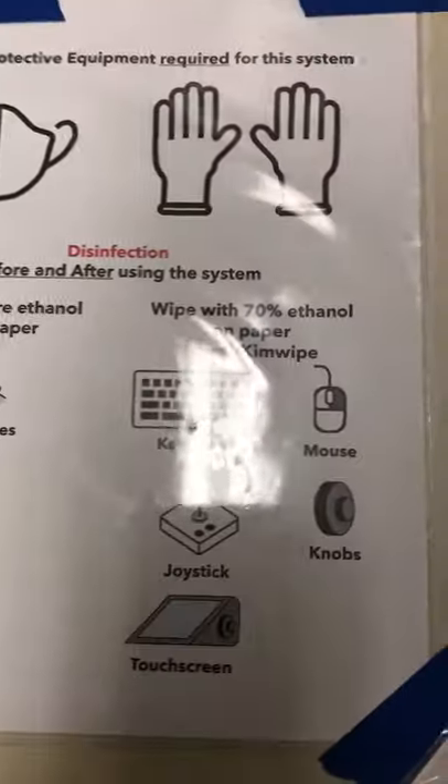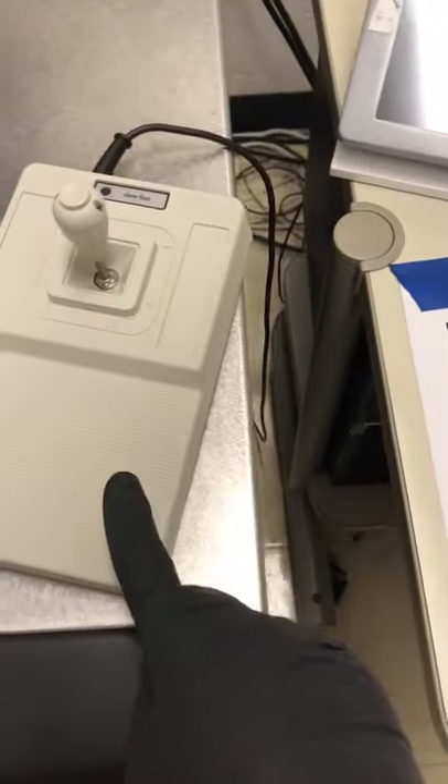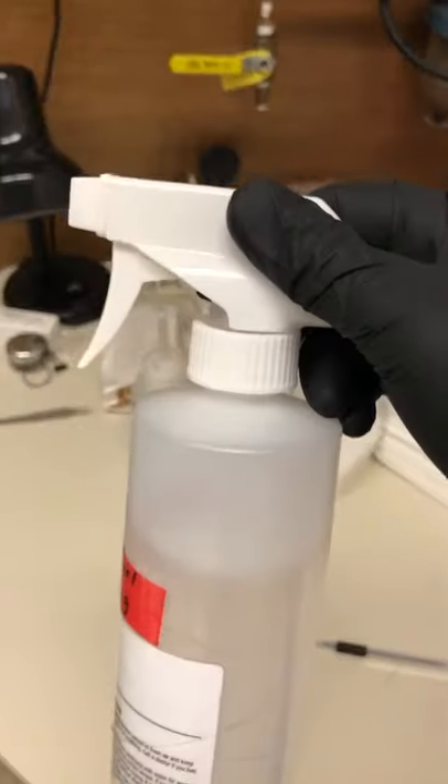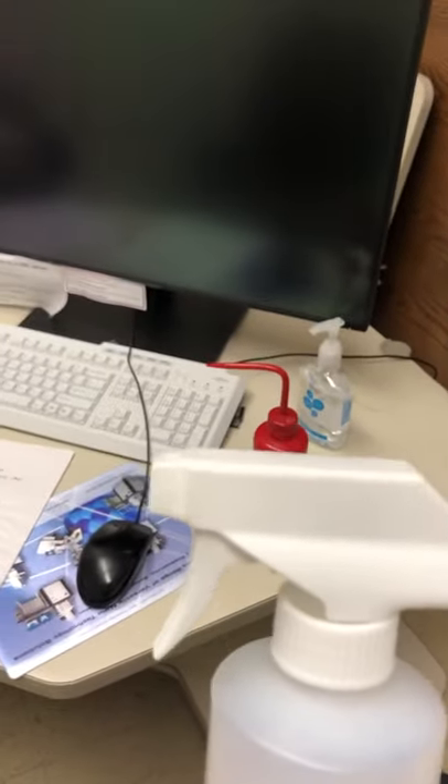With 70% ethanol on a paper towel or kimwipe we're going to wipe the keyboard, the mouse, the joystick, the knobs, and the touch screen. We have 70% ethanol here and paper towels and kimwipes. Please spray the ethanol on the paper towel and not directly on the microscope, then wipe with the paper towel.